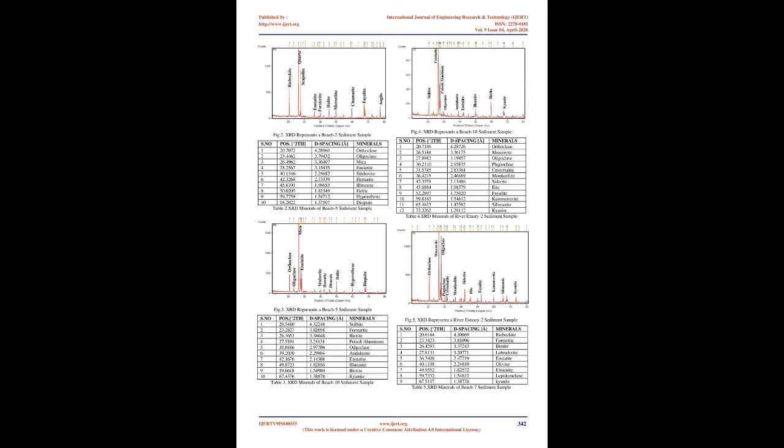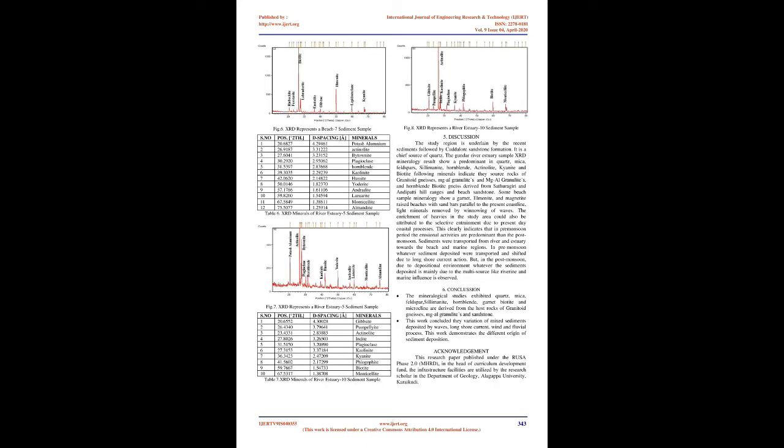The D-spacing values, 2 theta values, relative intensity, and names of the minerals are given in Table 1 to 7. 4. Results. 4.1 X-ray diffraction analysis. X-ray powder diffraction, XRD, is a versatile technique that can be used to identify any sediment substances. It can also be used to quantify the proportions of different minerals or indeed many other substances when they are present in a mixture. Over the past century, X-ray diffraction has gradually become one of the most important analytical approaches used in the qualitative and quantitative study of geological samples.